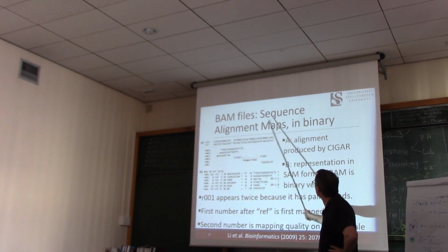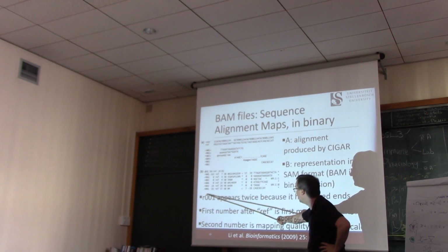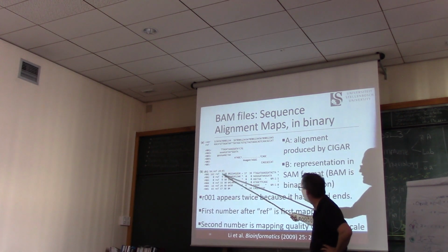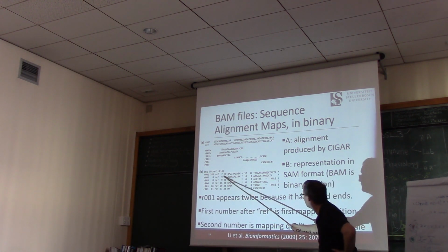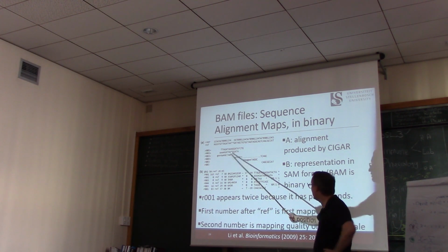And under the old sequence alignment map approach, you would have each read appearing at each aligned position. You're going to have some starting position. So here we see that read 1 starts its alignment at position 7. We also, you remember we had Phred scores that represented each base call.